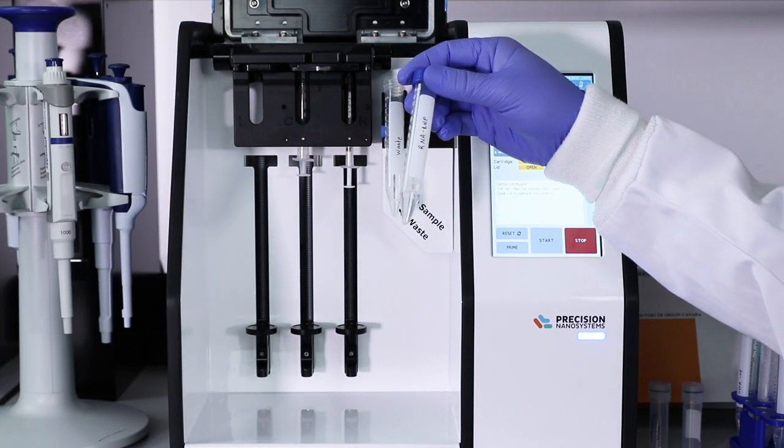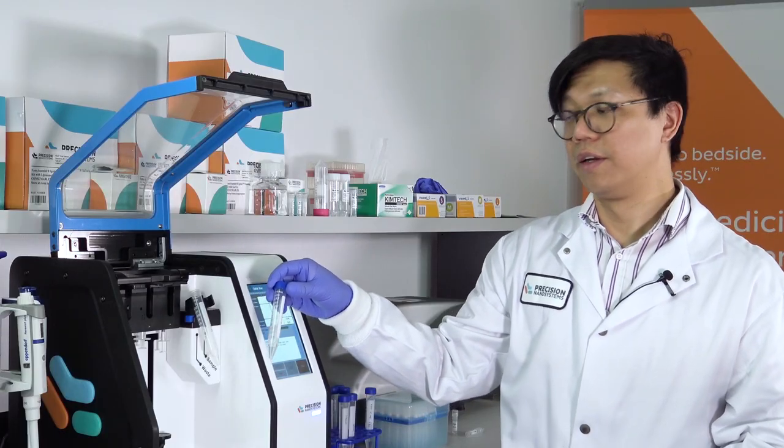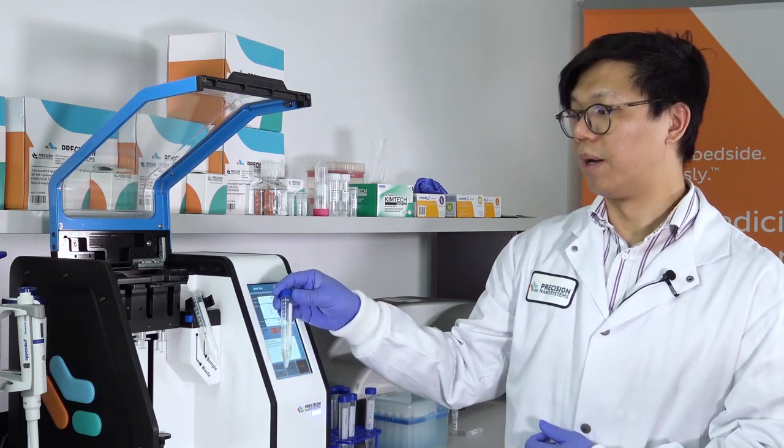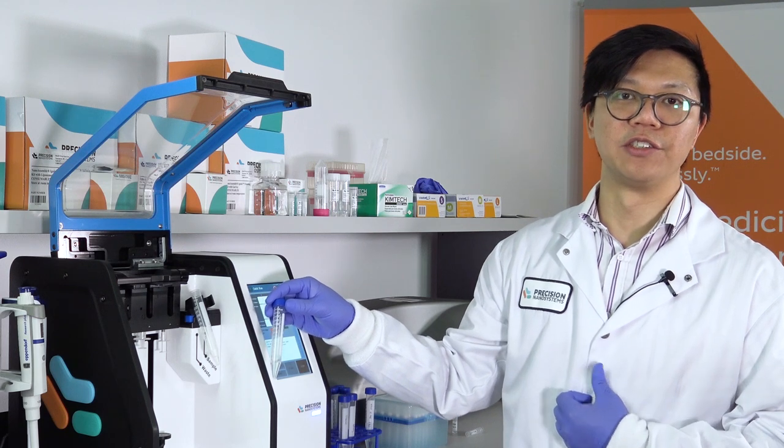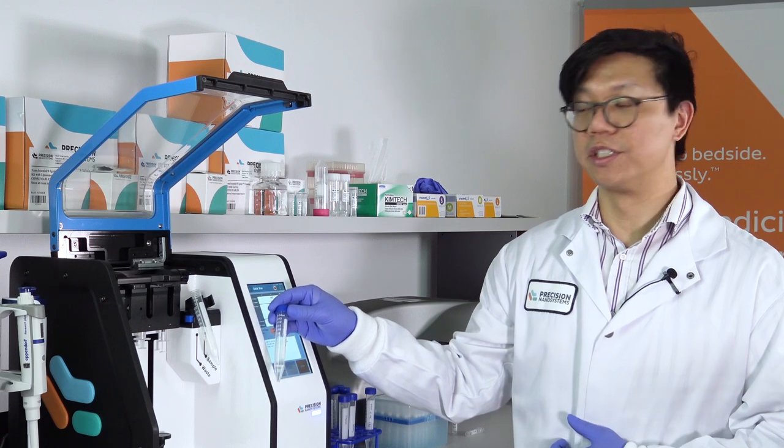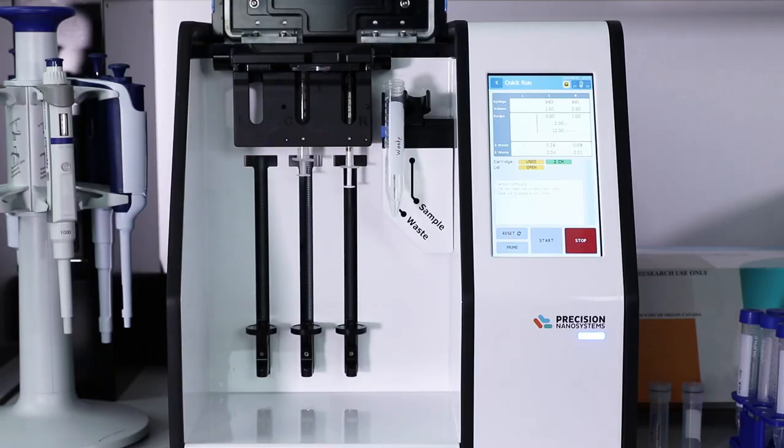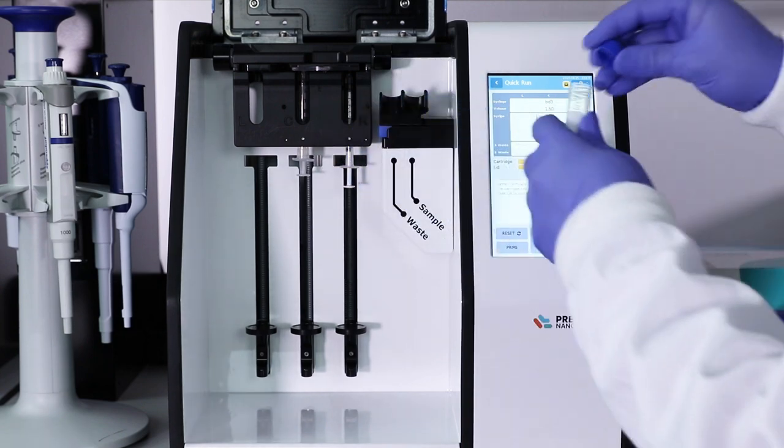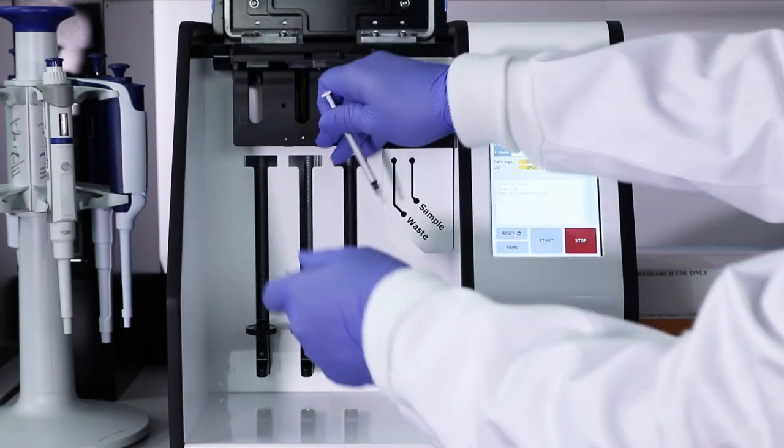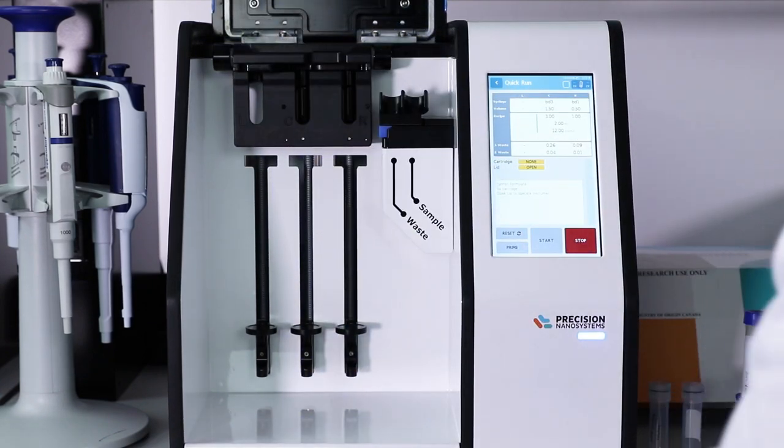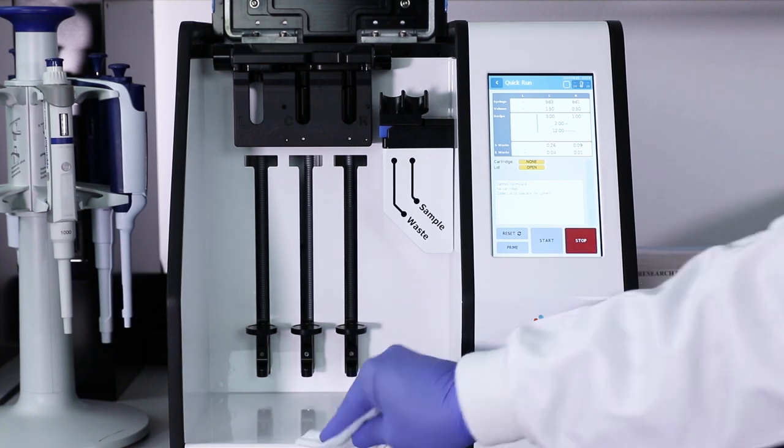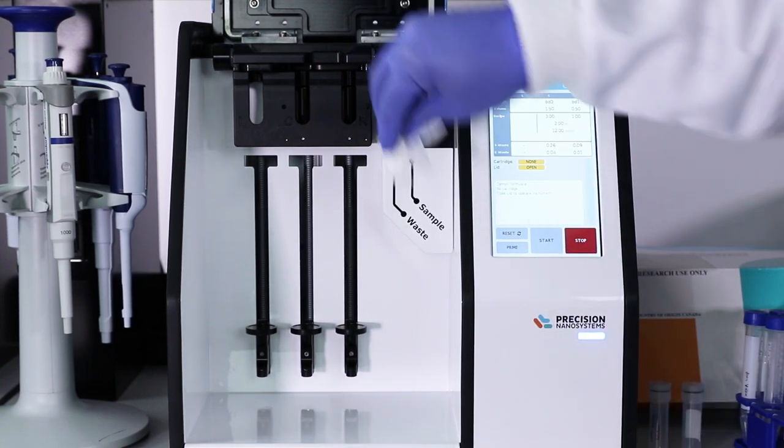As the sample comes off of the instrument, because we did a 3 to 1 formulation, it'll be in about 25% ethanol. Typically, you would dilute this right away and prepare it for downstream processing, such as tangential flow filtration, or at this scale, typically Amicon filtration, which is a centrifugal filtration method. We'll unload the rest of the instrument as well. We'll take the waste, remove the syringes and the cartridge, and that is all disposable. And last but not least, we will do a quick wipe of all the surfaces, and you're ready for your next run.